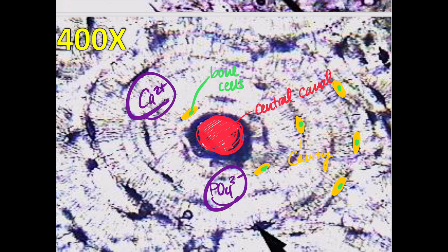And so bone cells cannot grow in cement, as in this calcium phosphorus matrix. That matrix is actually called hydroxyapatite. They can't grow in there. So to give them some space to grow, they're growing in these little teeny holes in the bone, these little teeny cavities, which I'm going to name in a second because they have a special name.